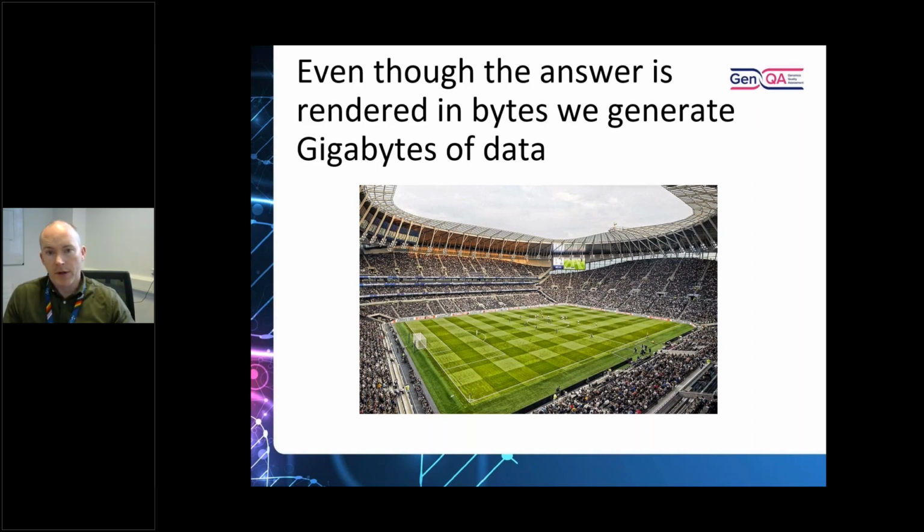The big thing when we're generating lots of data is the analytical side of things. We're generating millions, tens of millions or hundreds of millions of NGS reads, which are about 100 bases long, give or take, depending on what sequencing you use. And we have all of those contained in typically one file, called a FASTQ file or a BAM file. That just contains the raw reads of A's, C's, G's, and T's. Sometimes those can be aligned and tell us where we are in the genome, but generally we're looking at a massive data set relative to the volume of data we'll go down to.